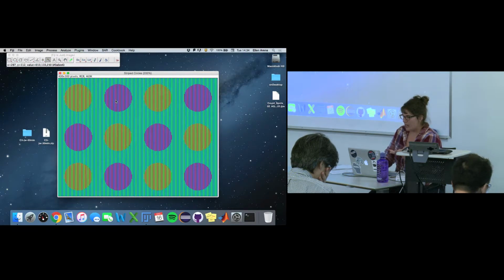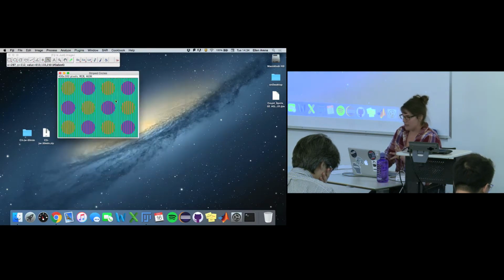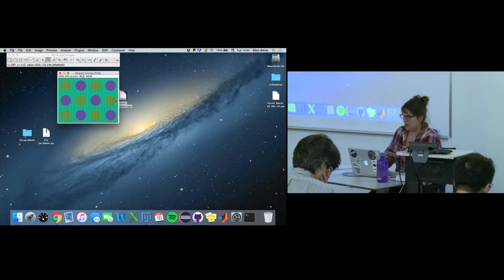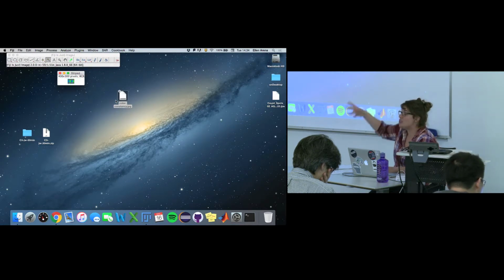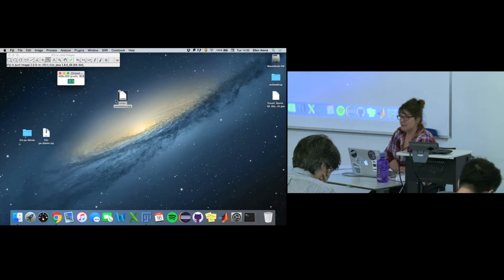As you zoom in and out, the colors change a bit from blue to green. You see the stripes, you don't see the stripes, and as you continue to shrink, some really weird rendering stuff happens, some rainbow effects. But this has nothing to do with the data itself, right? This is just ImageJ trying to render it quickly on the fly as you're changing sizes. So don't stress. That's all I'm going to say. Okay?